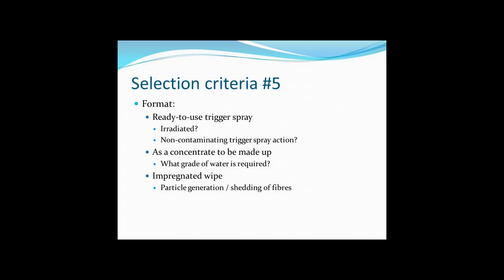With concentrates, you need to consider what type of water you're going to use to dilute it. If you're going to use a saturated wipe, does that wipe shed particles or fibres? This becomes an issue, particularly in grade A zones. And also, do you know that the wipe actually works? Has the disinfectant manufacturer provided you with information about the wipe and the disinfectant together, or have they simply provided you with information about the solution, not in tandem with the wipe? So that's the key question to ask.